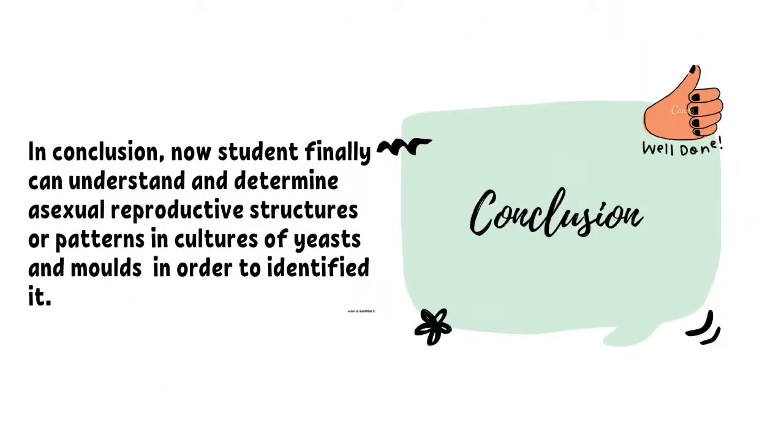In conclusion, now students finally can understand and determine asexual reproductive structures or patterns in cultures of yeast and molds in order to identify them.